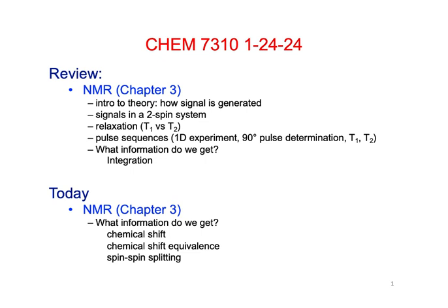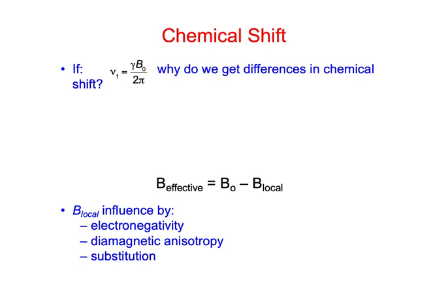All right, so we are still talking about NMR. So far, we talked mostly about some theory, and last time we just started talking about chemical shifts. So let's return to the beginning of the chemical shifts, because I got a little stumped there, which was dumb. So basically, we have this applied magnetic field, the big magnet.